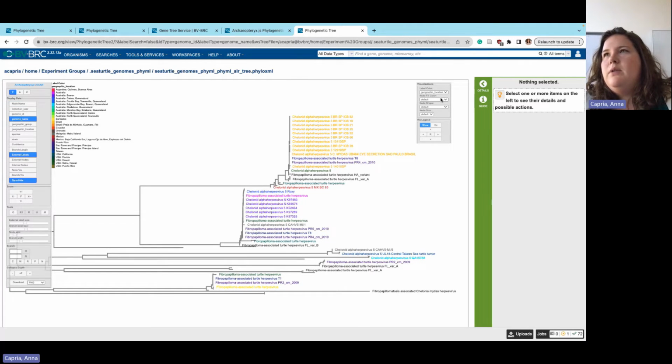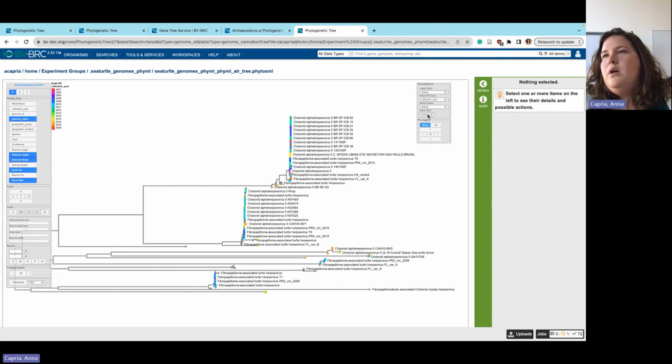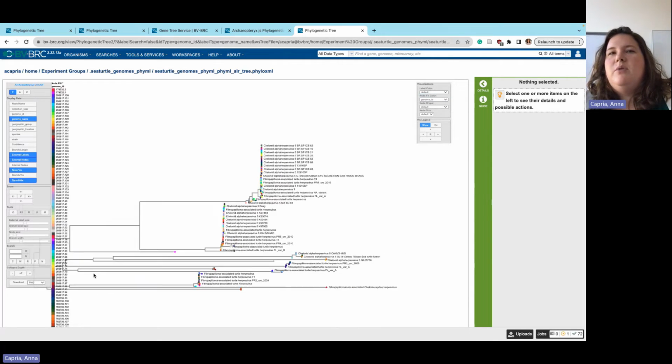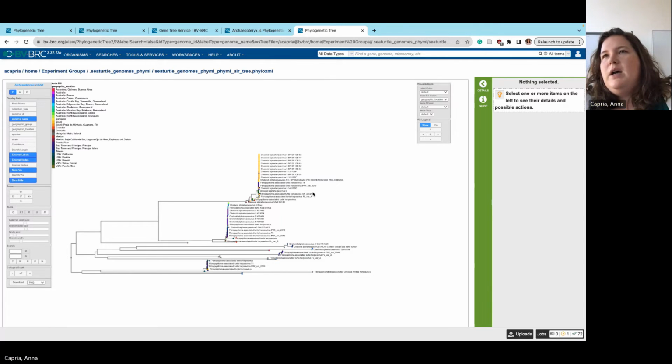You can do that with the different colors labeling. And the default is black. Can also label the nodes themselves. There are some features that aren't super helpful, like genome name or genome ID. That's going to pull out a bunch of different colors, since each one is different, that's not a helpful color scheme. So just keep that in mind as you're labeling by color.